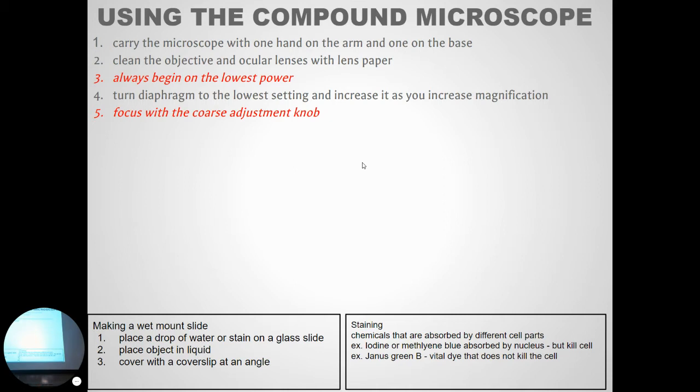This microscope works differently. What you see here on this microscope, it has this contraption here. That's called a mechanical stage. It's got a little clip that's spring-loaded that keeps the slide in place. And then to actually move the slide, you have these knobs that you turn. Rather than moving it with your fingers, one knob moves left and right, the other moves forward and back, and it just allows you to really have good control over the slide.